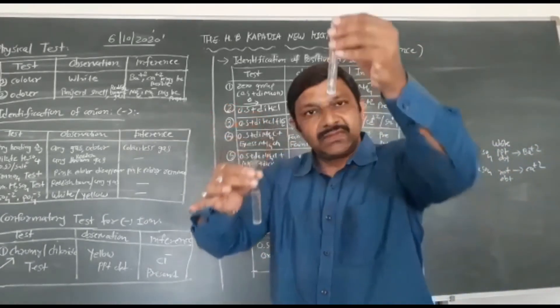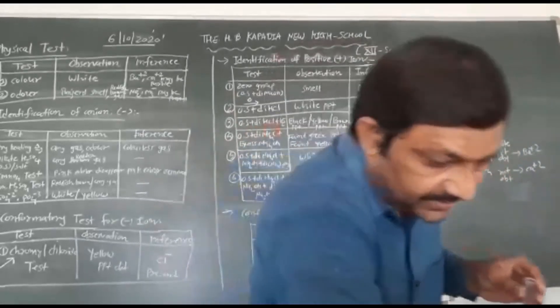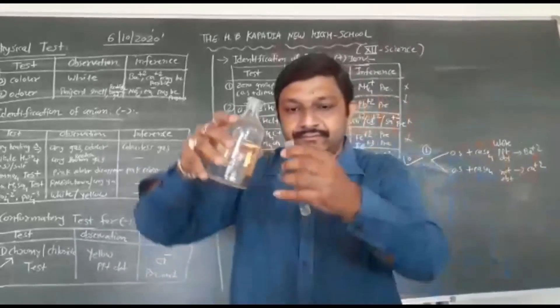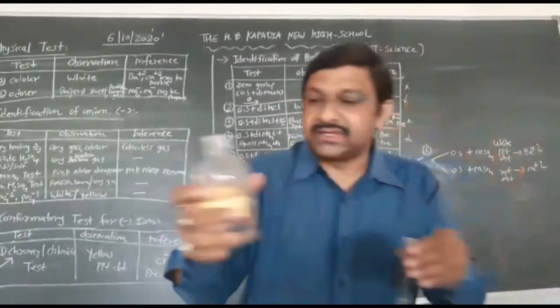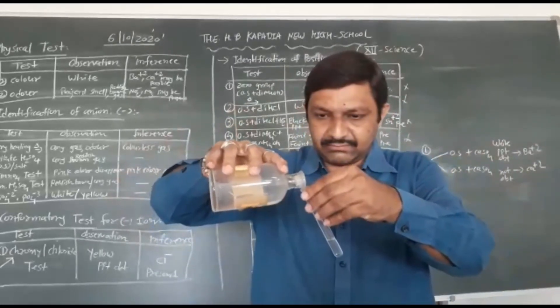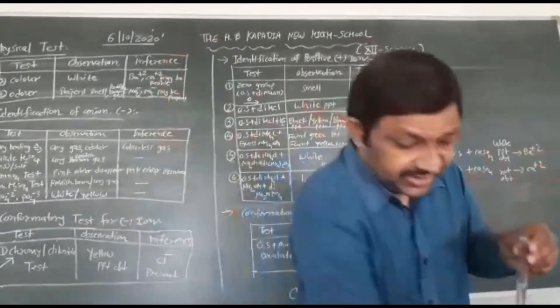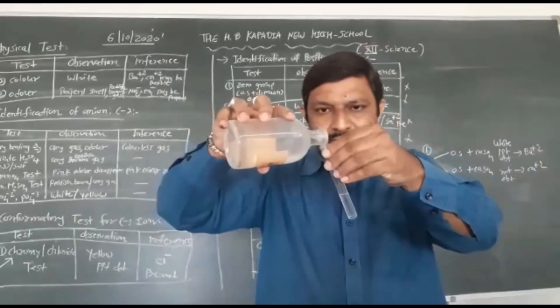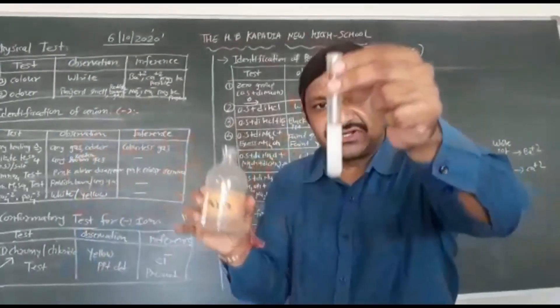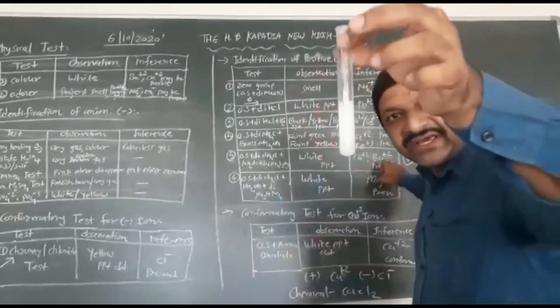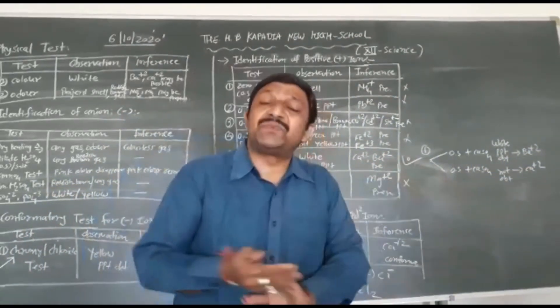We will perform the Ba/Ca group test directly. Here is your original solution. Add NH₄Cl — here is your NH₄Cl — then NH₄OH, and finally (NH₄)₂CO₃. A white PPT is obtained. Your Ba/Ca group is present. Now we will divide Ba or Ca.